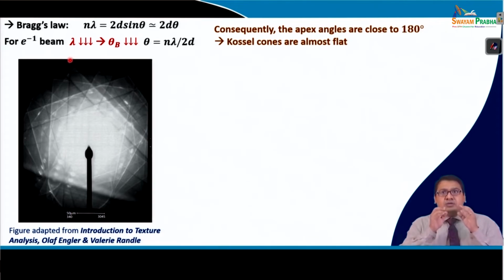So, when the incident electron beam falls on a very thin specimen, from where we can obtain a Kikuchi band, meaning from the thicker part of the thin specimen, then the direct incident beam falls, making a very bright area on the phosphor screen. However, when excess and defect lines arise because of the diffraction, formation of the Kossel cones and formation of the Kikuchi pattern, the diffraction pattern basically looks like this.